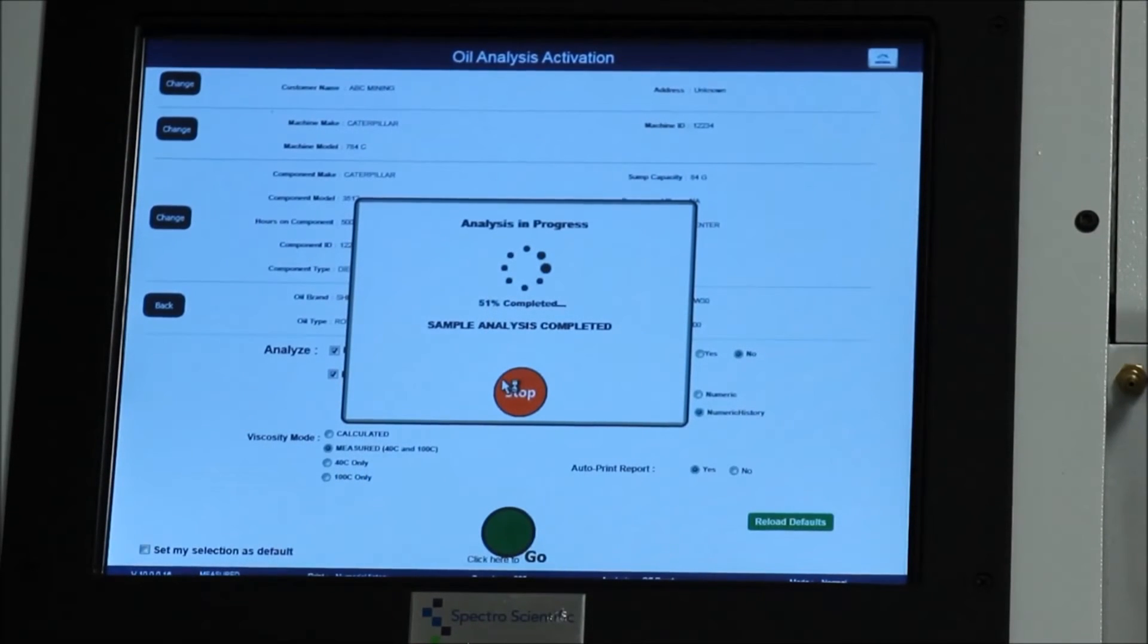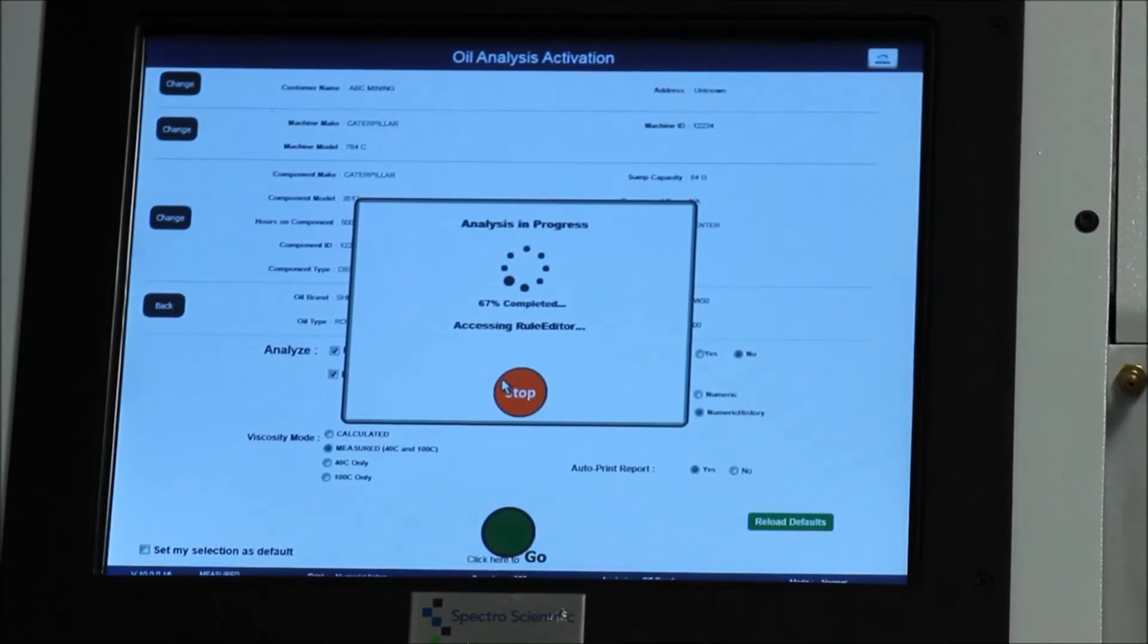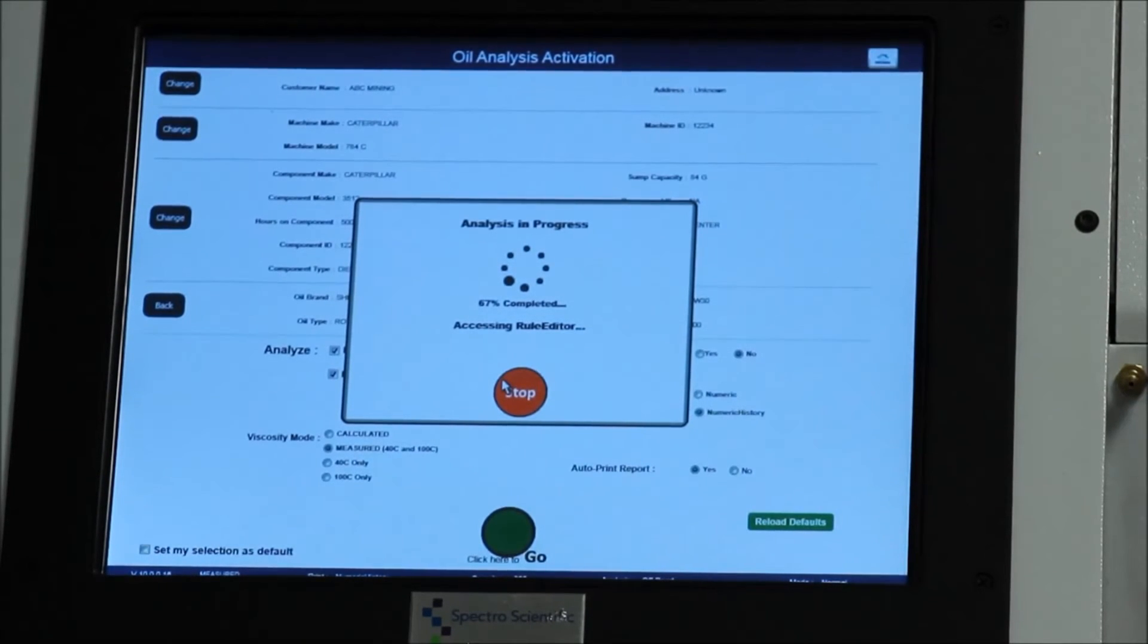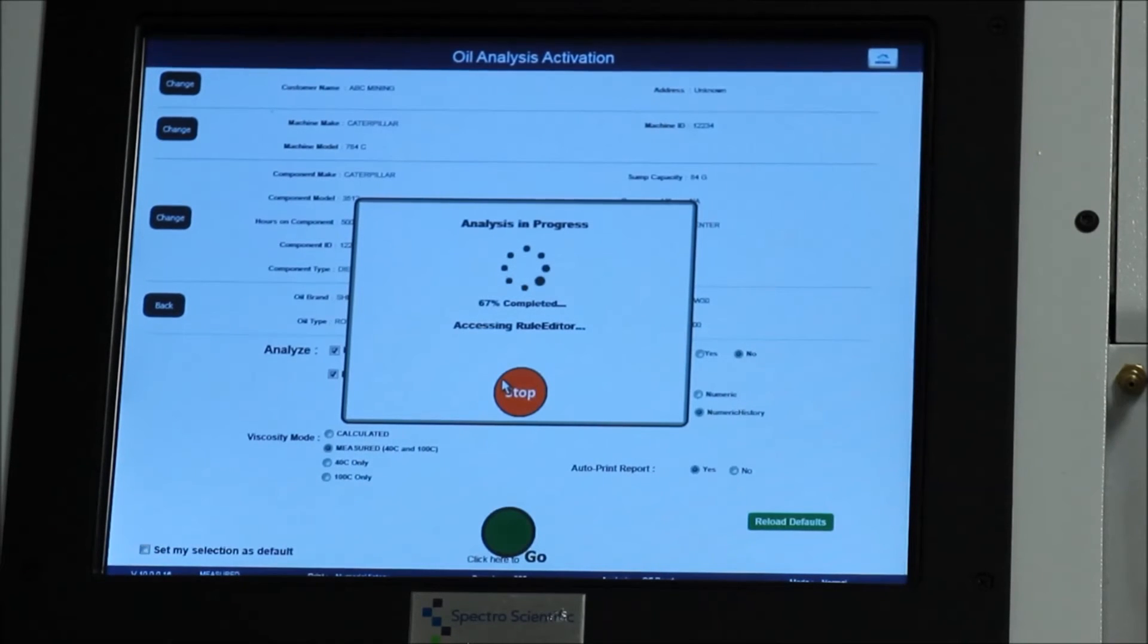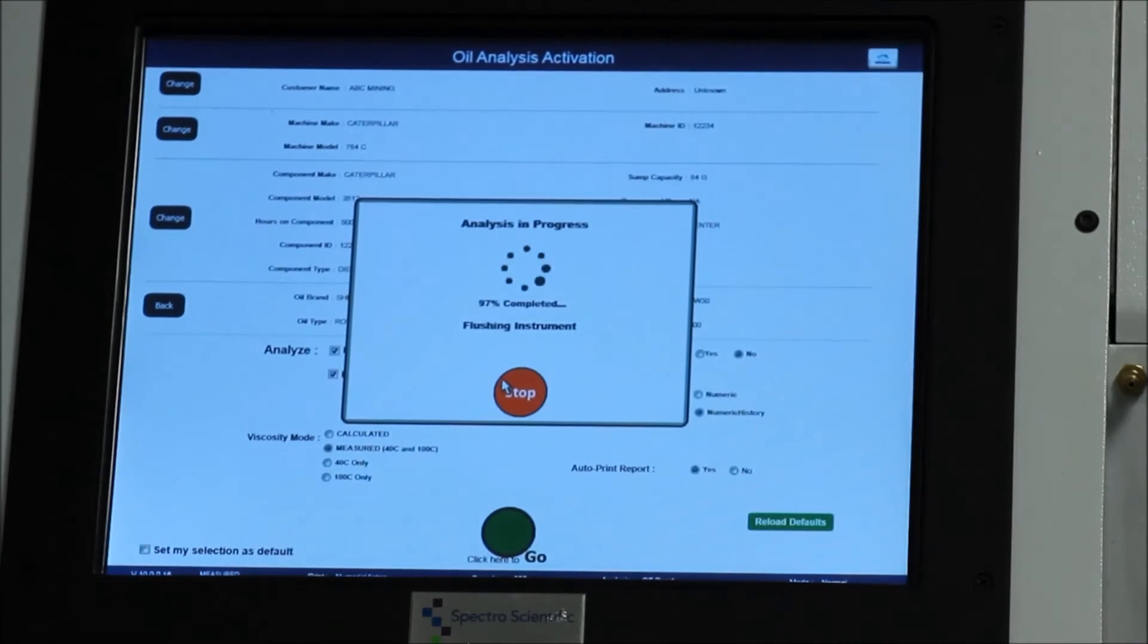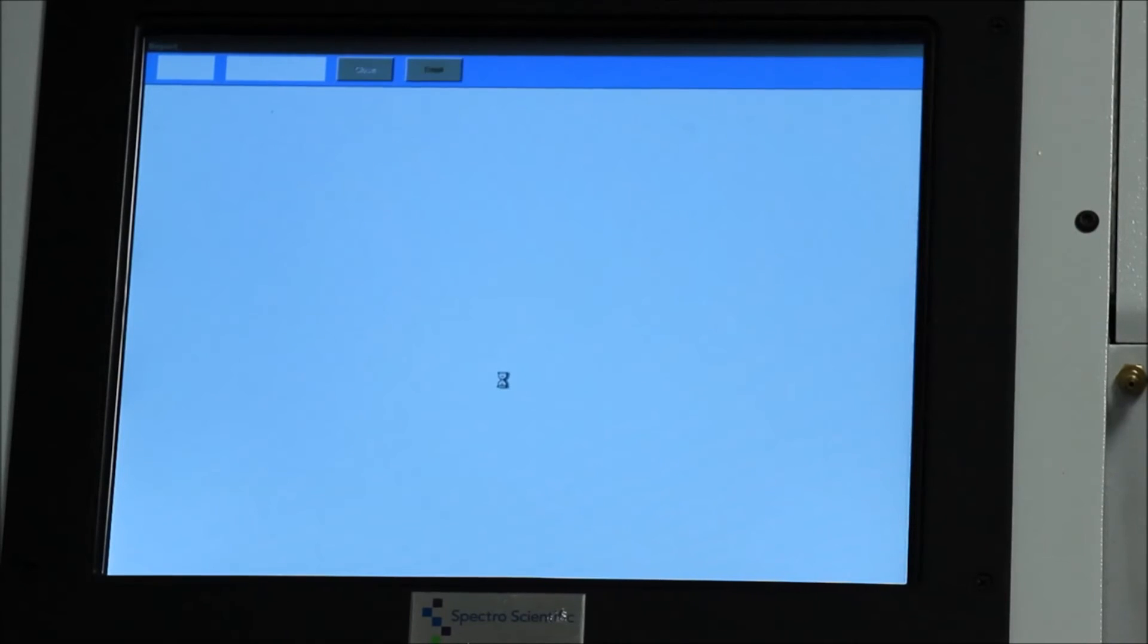So now you can see that the sample analysis is complete. And it's starting to access what we call the rule editor. And this is matching up the data to the diagnostic statements that we'll see on the report. And finally we'll see the instrument is flushing. So this is cleaning the sample or cleaning the instrument for the next sample.